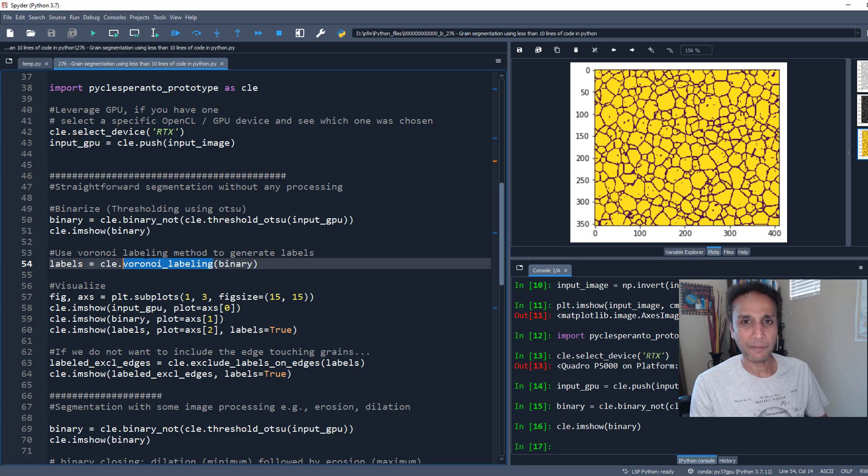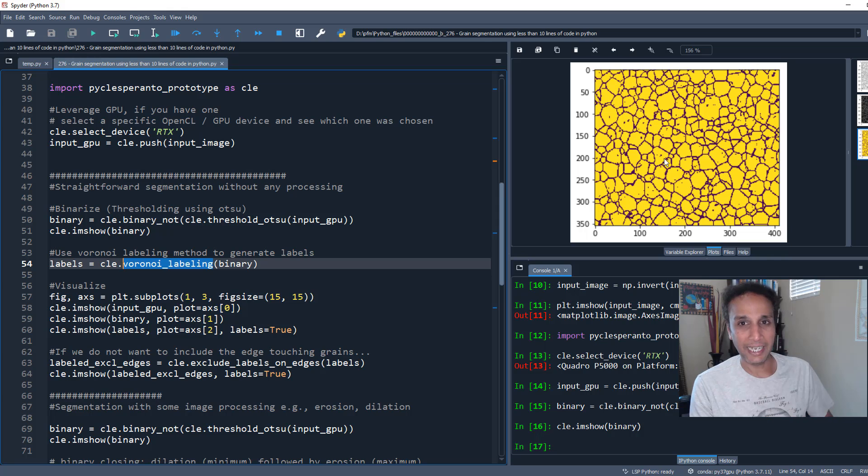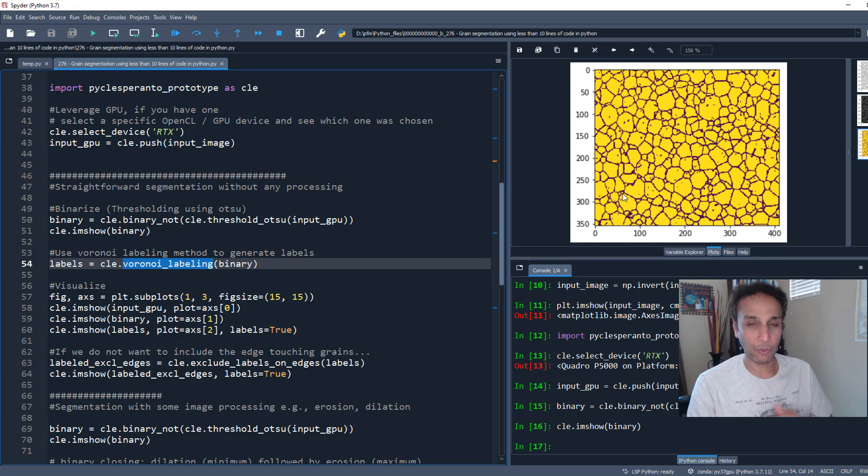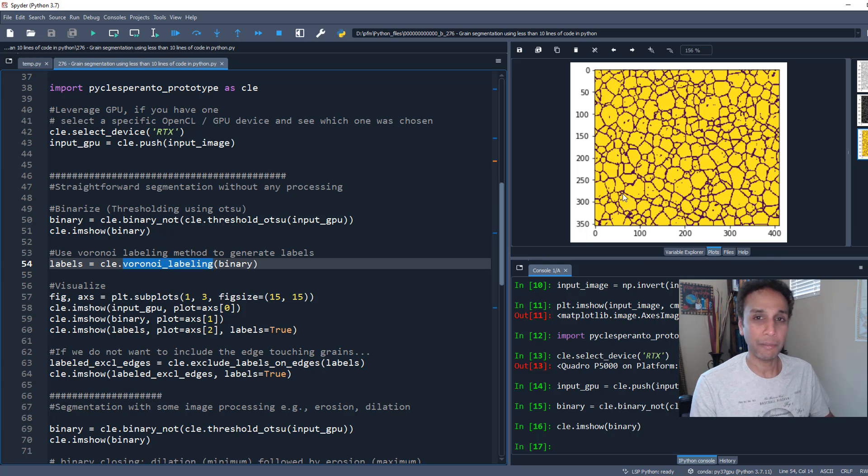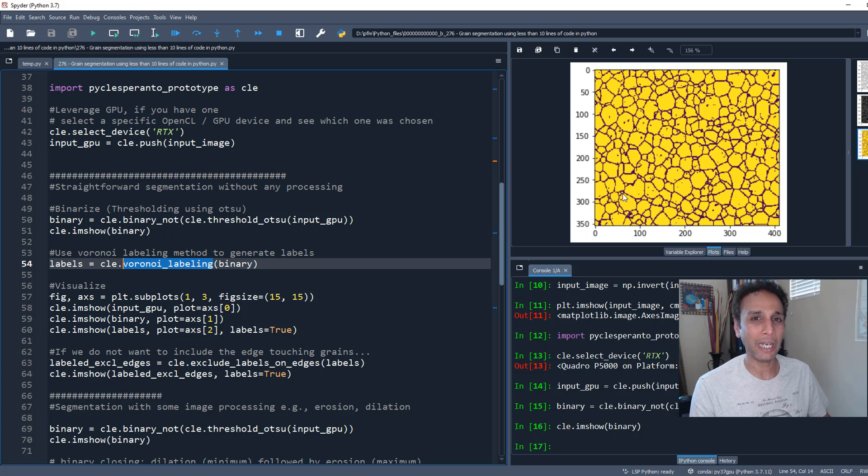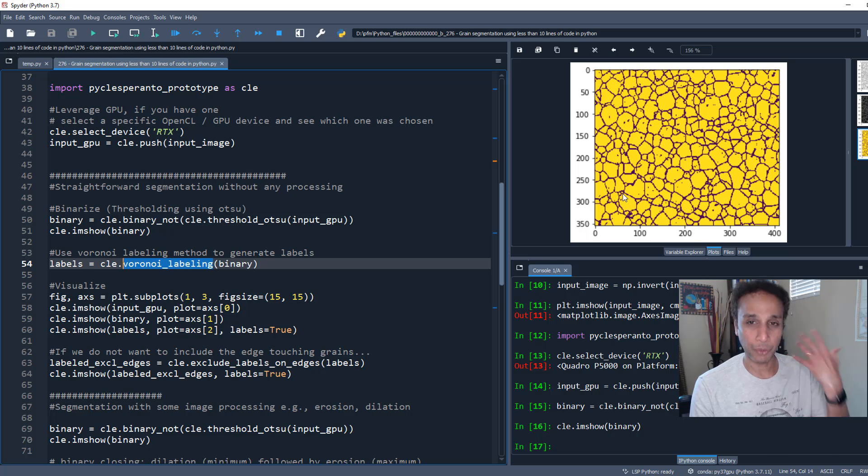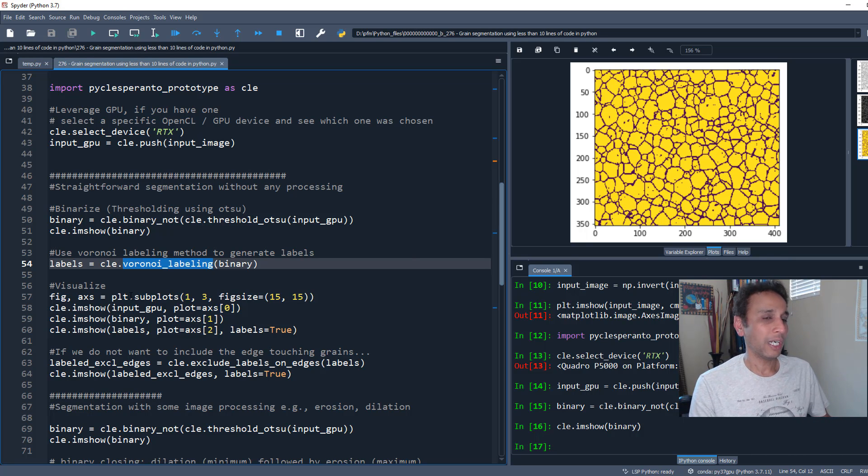Now let's do watershed labeling. What does watershed do? It finds the centers of each grain and uses that as a seed, dividing your areas into different watershed regions. If you have no clue what I'm talking about, go back to videos 273, 274, 275.